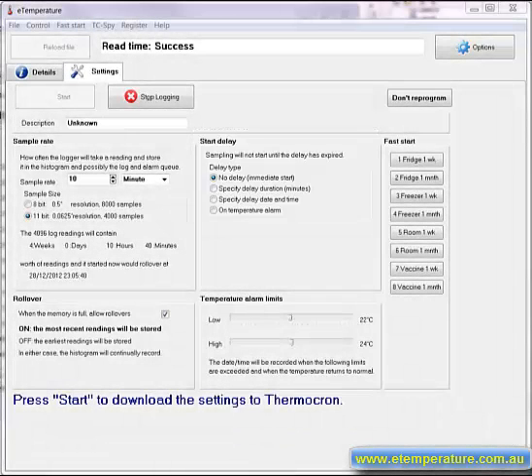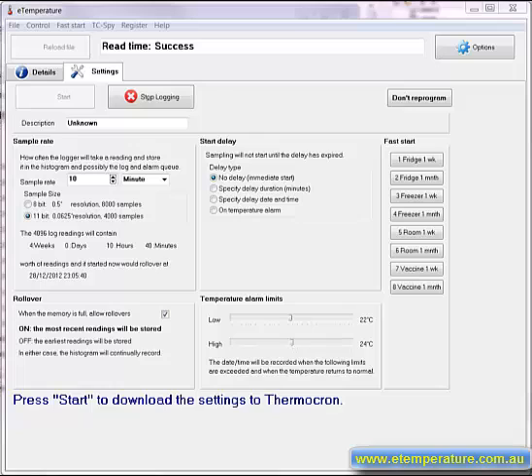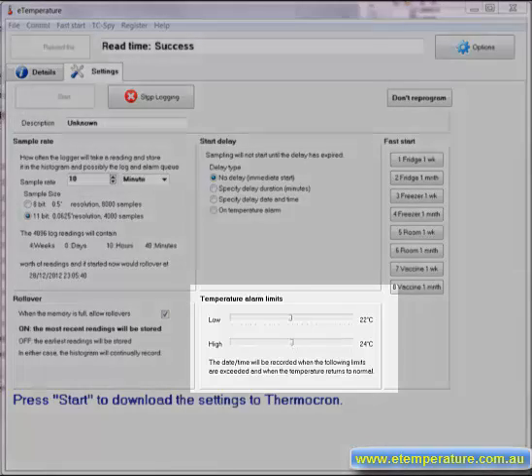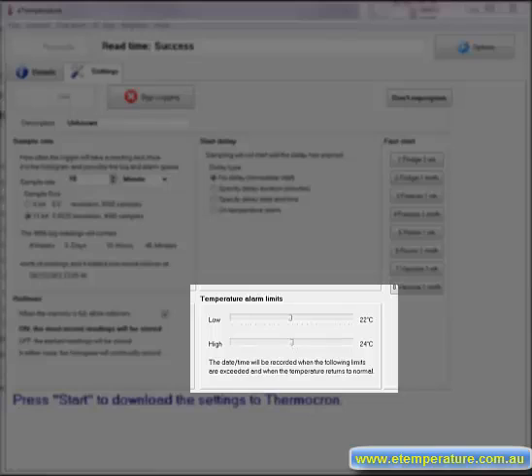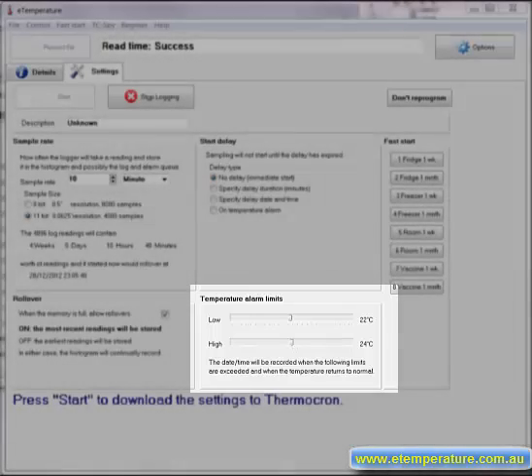The temperature alarm limits are the final set of options. They have a very minor role and if you don't set them correctly it doesn't matter. You will see their impact in the video on retrieving the results.